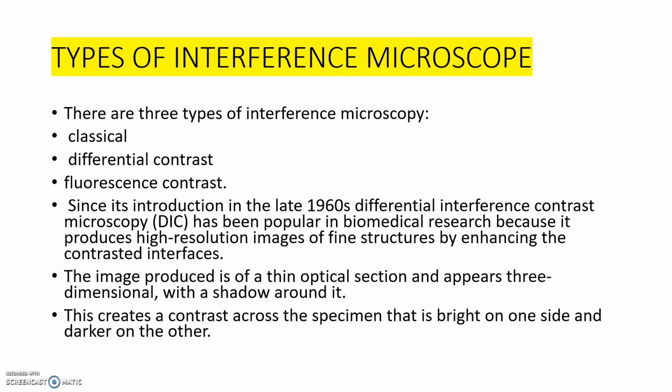Next are the different types of interference microscope. There are mainly three types of interference microscopy: classical interference microscopy, differential interference contrast microscopy, and fluorescent contrast.